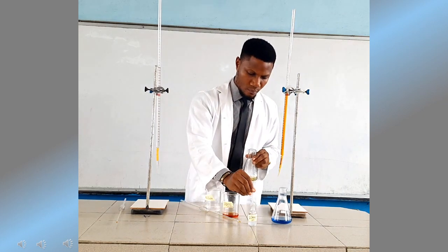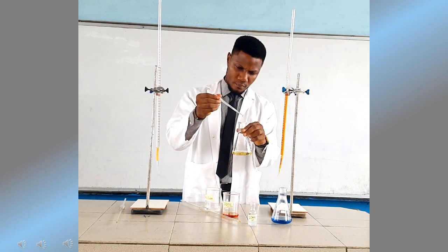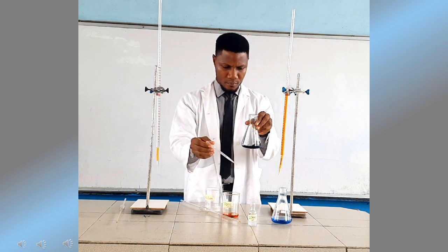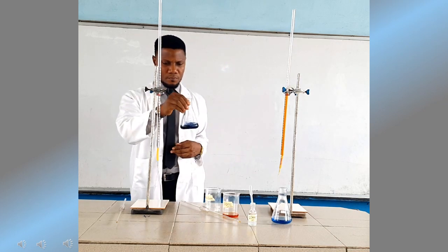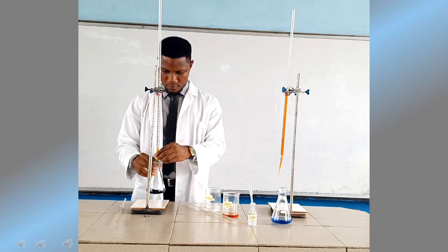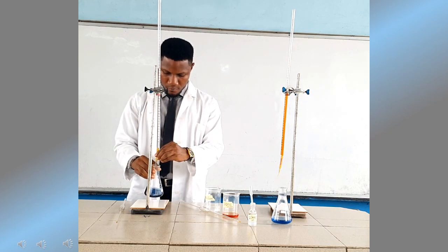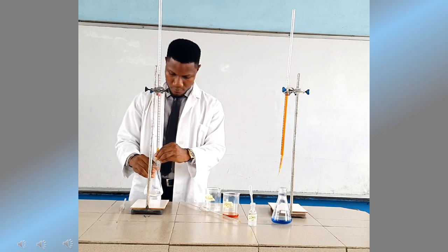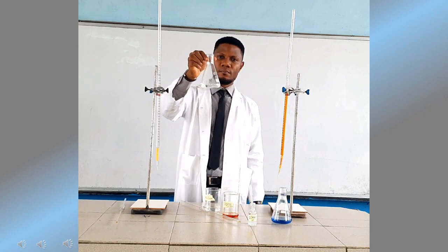Then after getting this pale yellow solution, we then add our indicator. The starch indicator is added. Let's not forget, preferably 2 to 3 drops. So we go back to our titration and we continue again until we get to the end point. The end point is colorless.